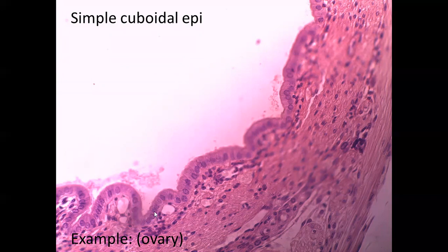Why cuboidal? The cell width and thickness are roughly similar, the cells are cubic or square, and the distance below the nuclei and above the nuclei is equal. For this reason it is called simple cuboidal epithelium. Example: the lining of the ovary.